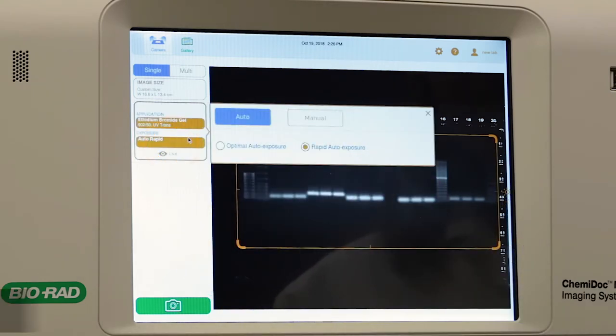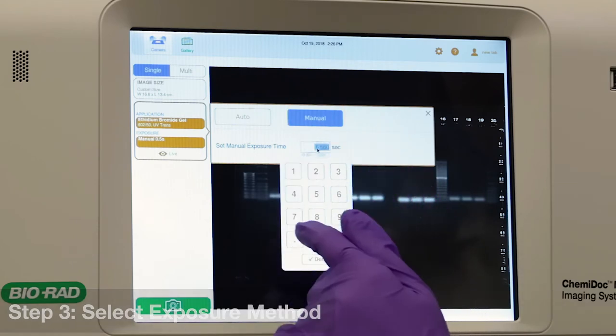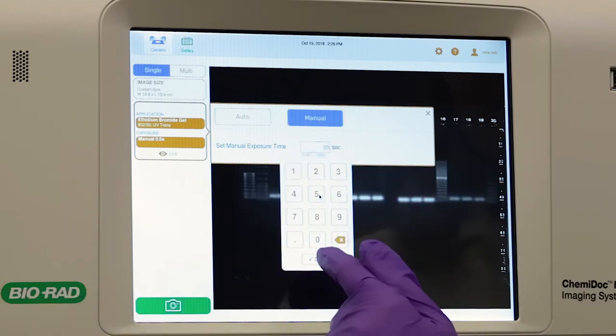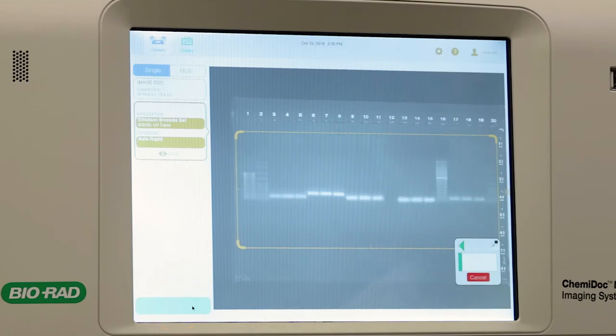Choose between entering your predetermined exposure time or automatic detection of your bands. Tap the camera button to capture the image.